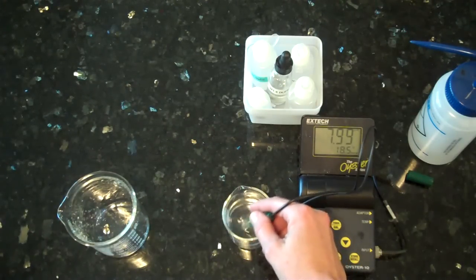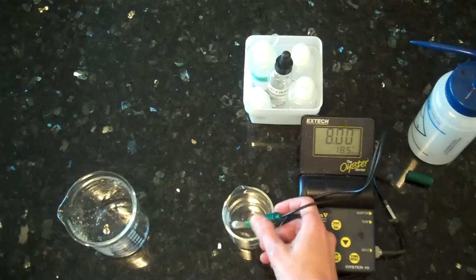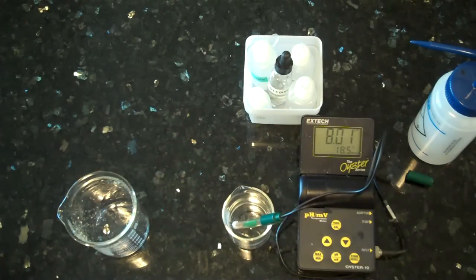This is settling at a pH of about 8.01. That last digit often fluctuates slightly. Now it's at 8.02, but it is within plus or minus 0.05.